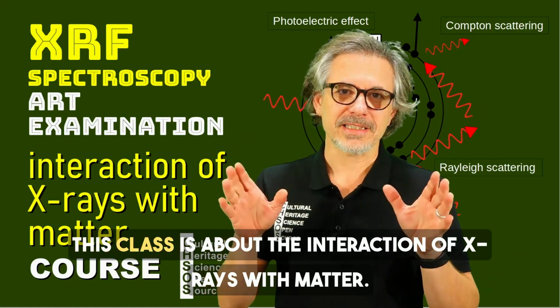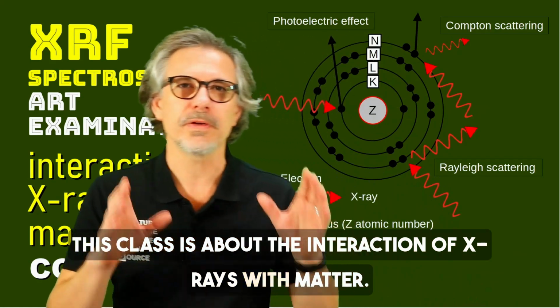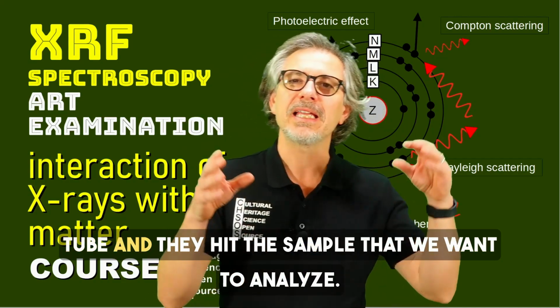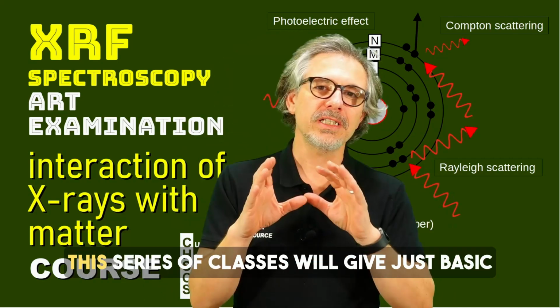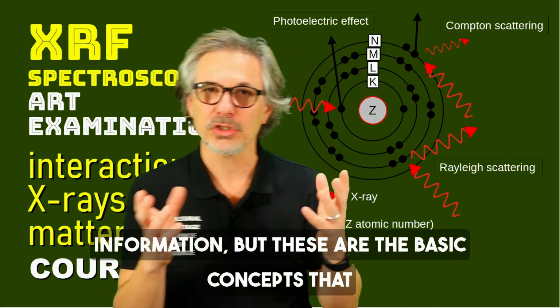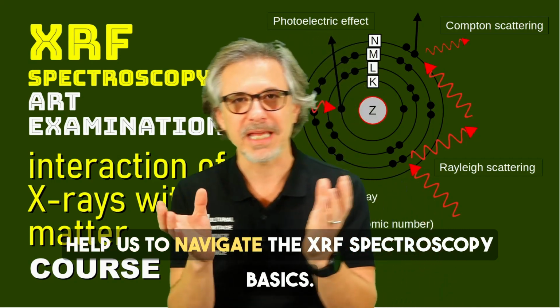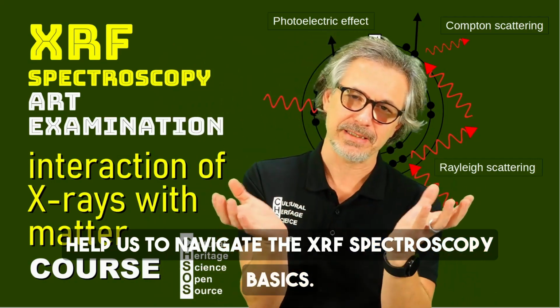This class is about interaction of X-rays with matter. So what happens when we have our X-rays from the tube and they hit the sample that we want to analyze? This series of classes will give just basic information, but these are the basic concepts that help us to navigate the XRF spectroscopy basics.